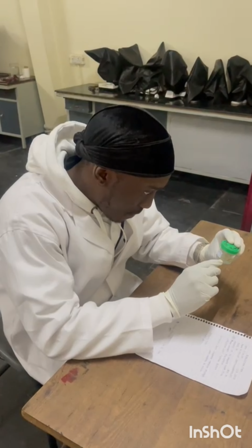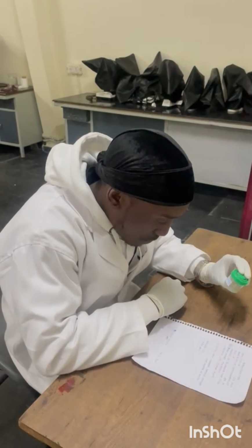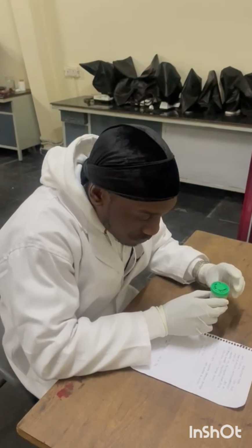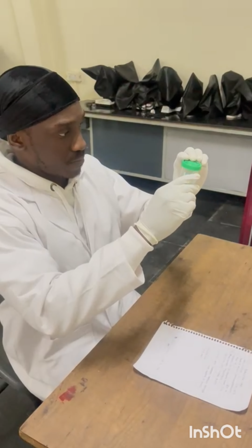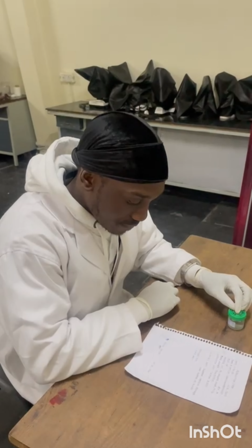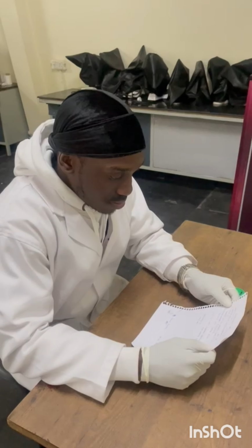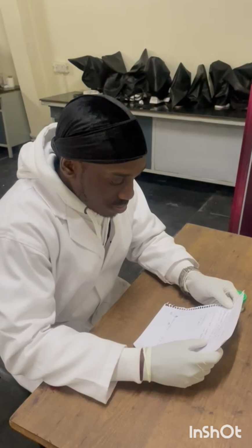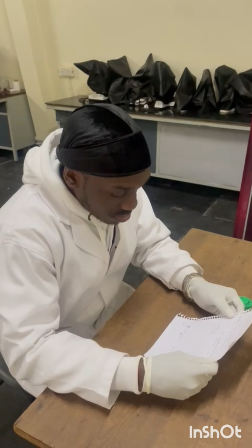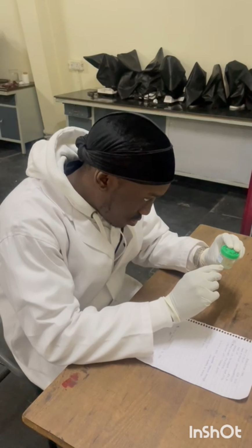The sample reception process typically includes the following steps. First, receiving the sample from the healthcare provider or authorized personnel. Second, verifying the sample label and documentation to ensure that it matches the patient's identity and the medical record. We have to inspect the sample for visible damage, contamination, or other issues that may affect the testing of the specimen. Documenting the sample's condition, including any notable features or issues.